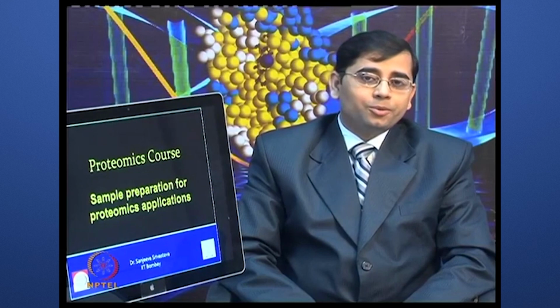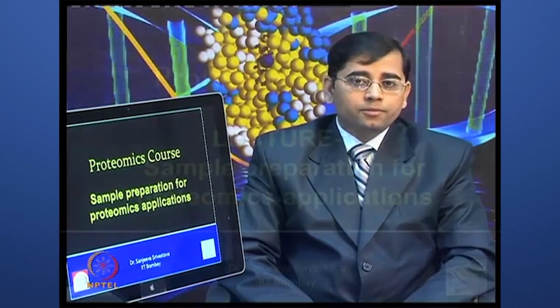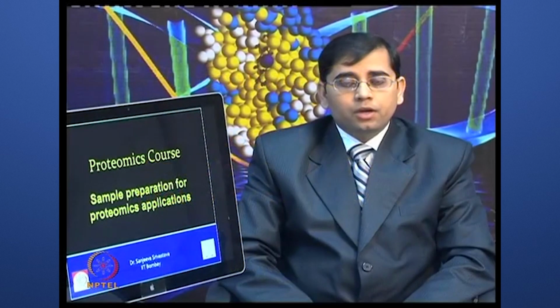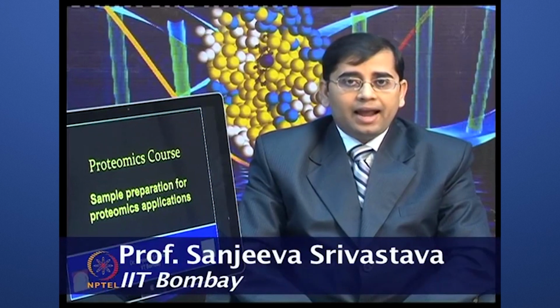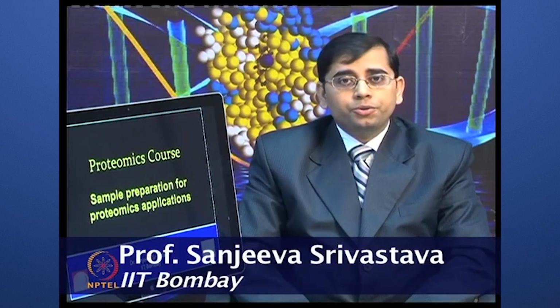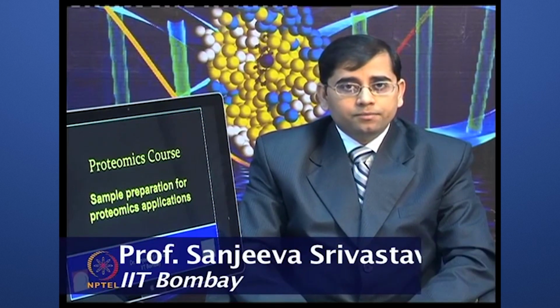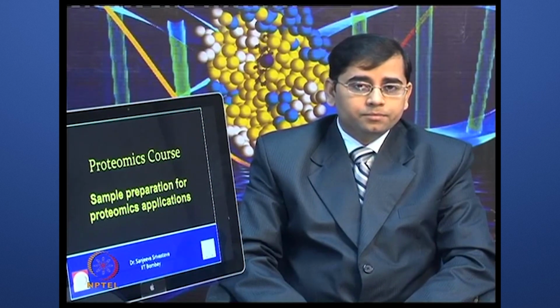Welcome to the Proteomics course. In today's lecture, we will talk about sample preparation for proteomics applications. As you know, a very good sample is essential to perform any good experiment, and especially when you want to characterize thousands of proteins in a given experiment, it is very essential that you start with a very good sample.